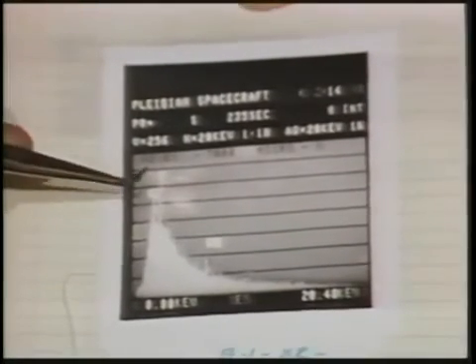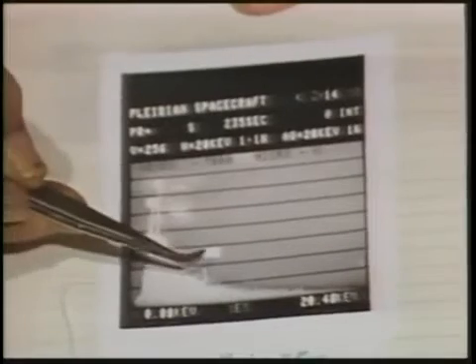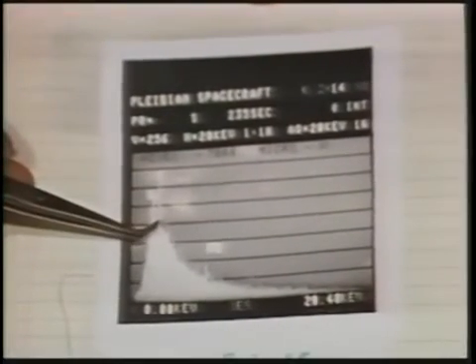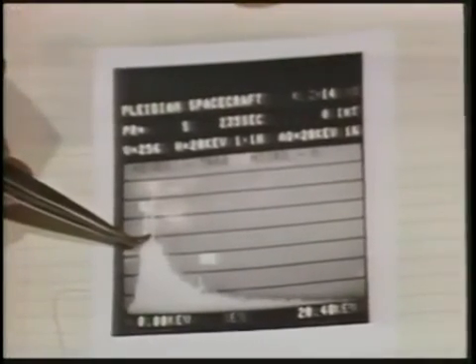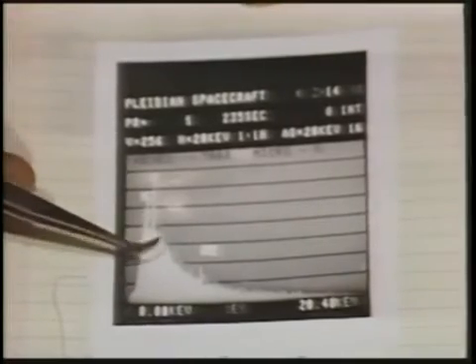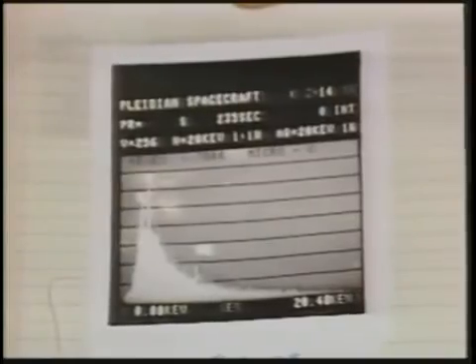In this crystalline area, the predominant element was silicon, which is this band here, and iron, and there was a secondary band of sulfur, which is right here. These were very, very intense bands, and we did not attempt to go through the analysis of all the other particular lines that were present. We just took the three main ones and stopped there.